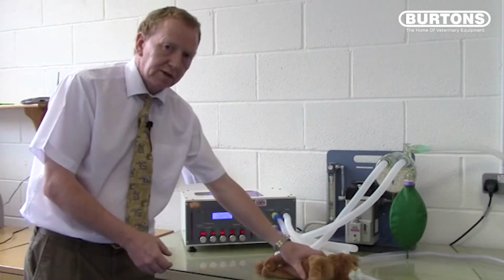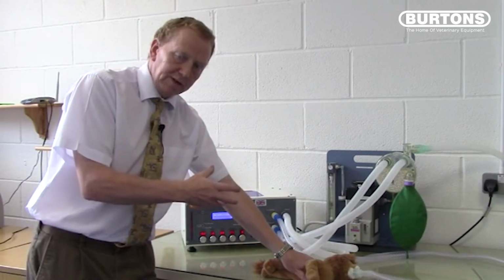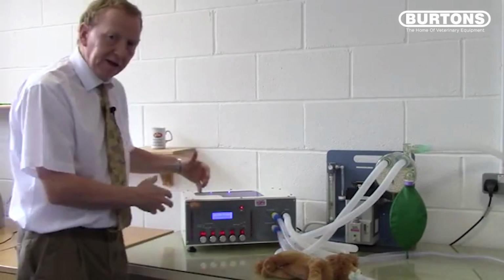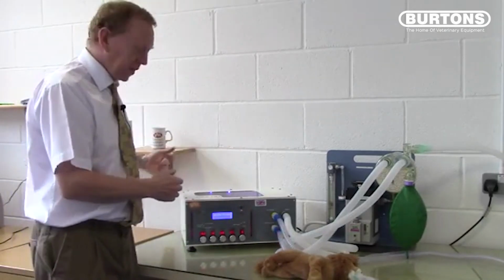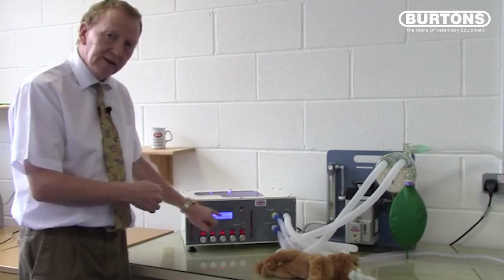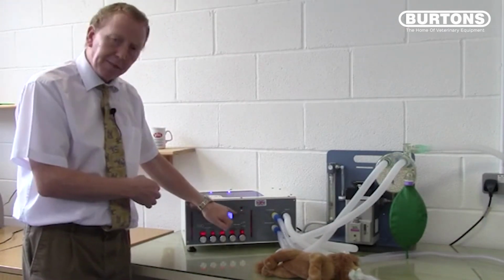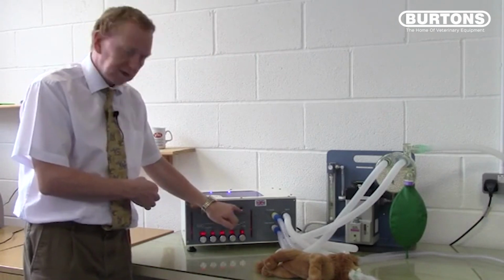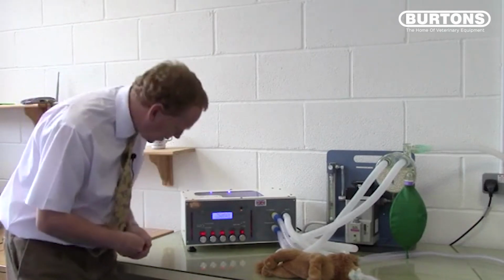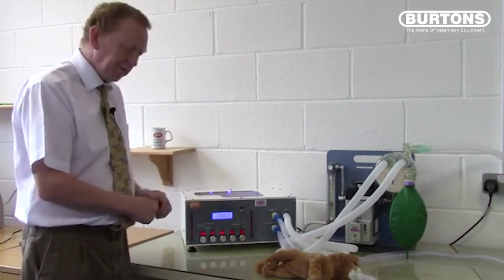So if I am to occlude this now and restrict the movement of the chest, the 150 mils is delivered into a smaller volume, and so the alarm will sound because the pressure will rise. In that instance, the piston will stop going forward, come back and try again. You'll see that the alarm maximum pressure exceeded has appeared on the screen and will not be removed even though the ventilator is ventilating normally until that warning has been recognised and reset by pressing the alarm reset. And now we're back to where we were, an airway pressure maximum of 11 or 12 and a respiratory rate of 15.